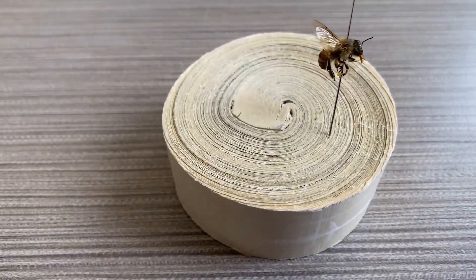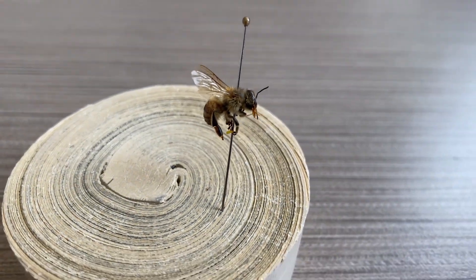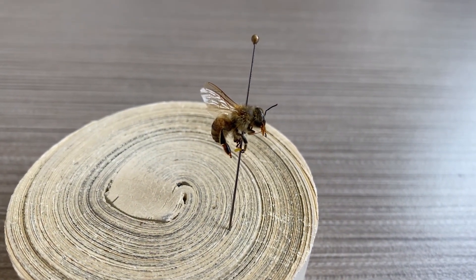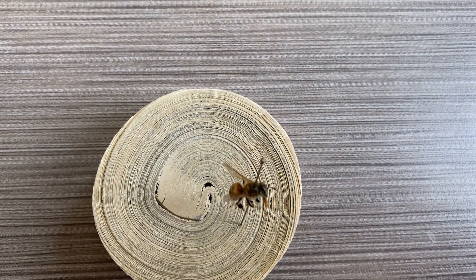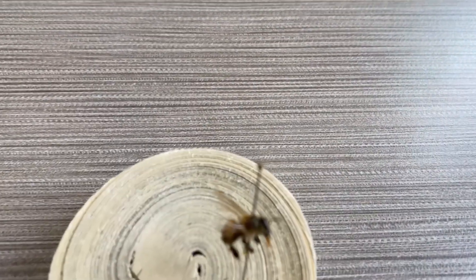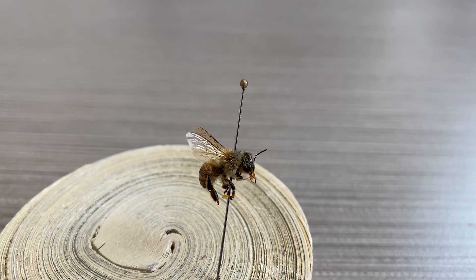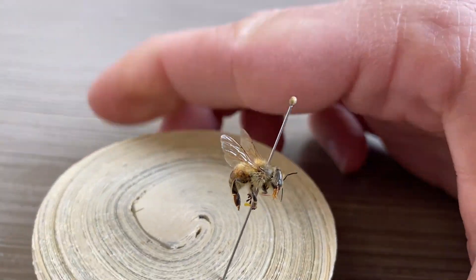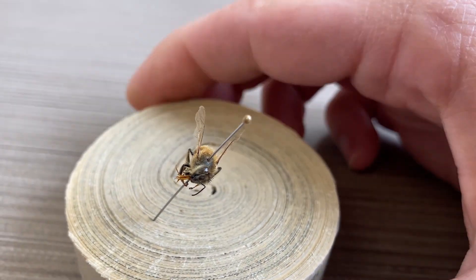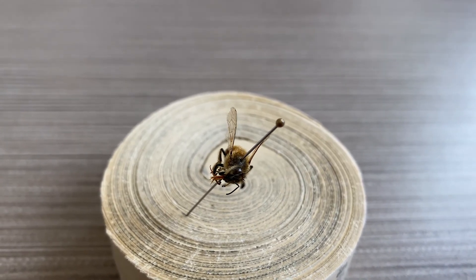So I pulled out one of these bees that I pinned in the field. You can see its head is kind of twisted, its legs are curled under. It's a cool looking specimen — this is a European honeybee — but this is not ideal for photography, because a lot of the features that you might want to look at are tucked under the body.